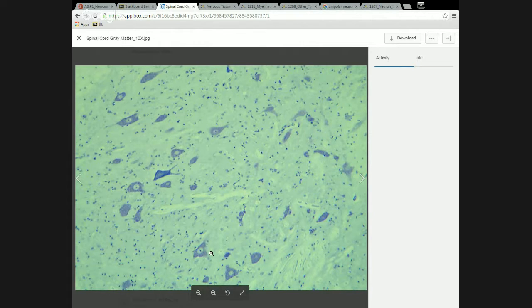It's some sort of Hungarian or Slavic name. I don't remember exactly where it comes from. But it's a variation on staining. Most of the stains we look at, we usually see a nice dark nucleus, and then the cytoplasm will be a lighter color, and then extracellular space will usually be very light if stained at all. In a Nissl stain, what we see in neurons is that the cytoplasm stains darkest, and the nucleus usually is a little void in the middle. Okay. So let me go to the 40x objective version of this, which will actually zoom in on these cells right here.